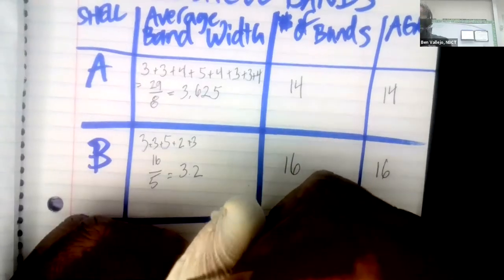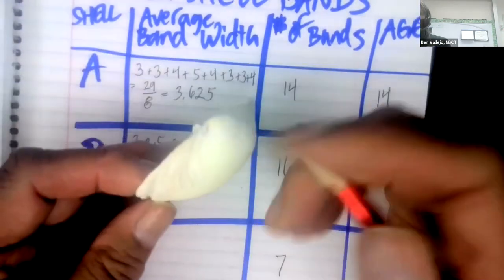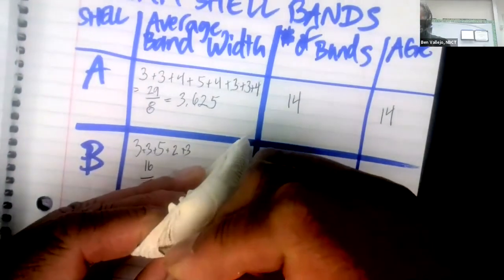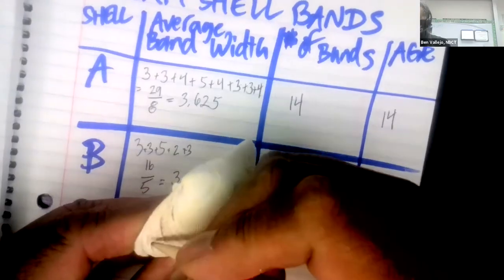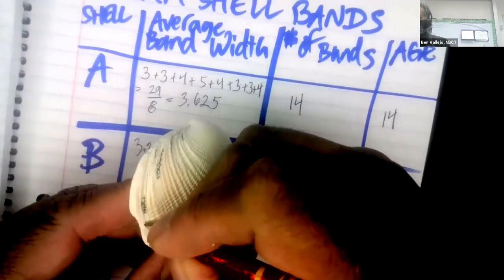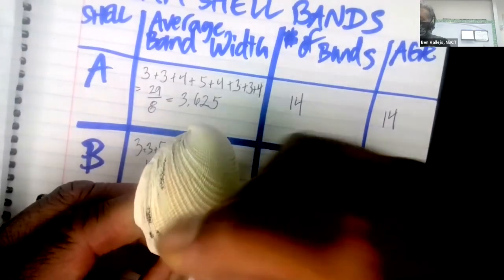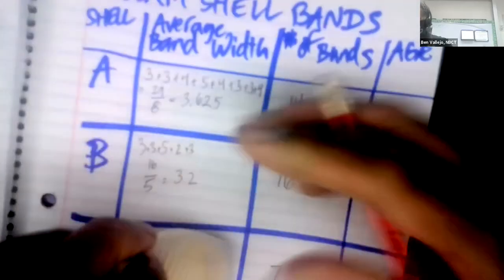And again, I can see it on the sides easier. So where there's a good sized crack, that's a band. Not all of them are annual bands. I mean, obviously they're bands, but they're not all annual bands. And this one I actually put right in the middle in between 2 bands.